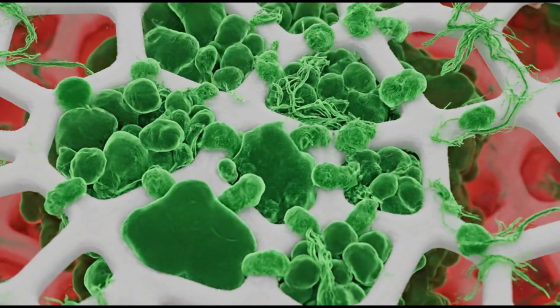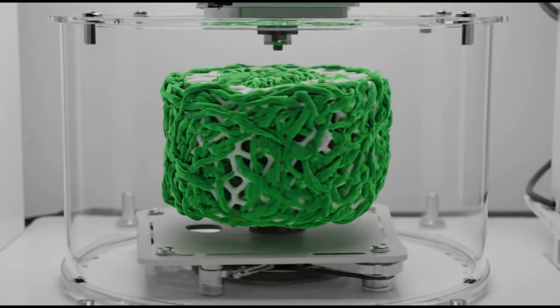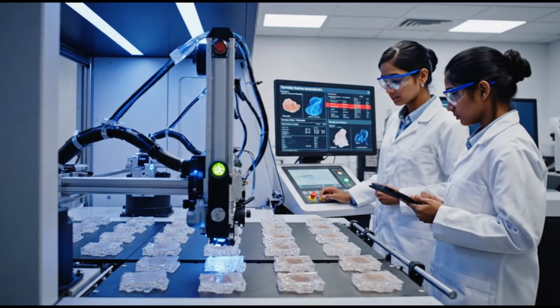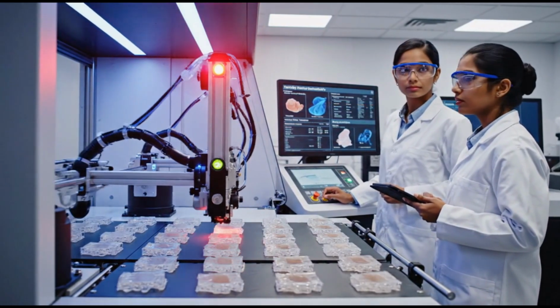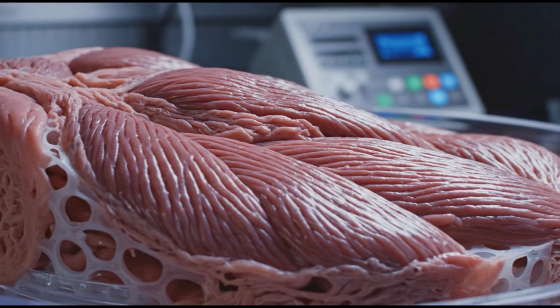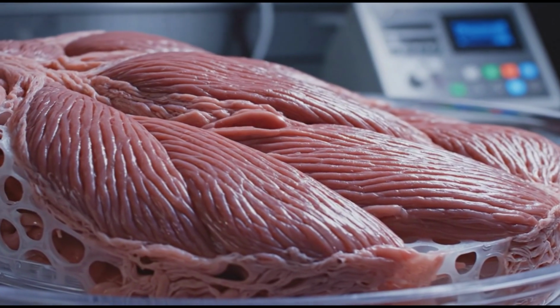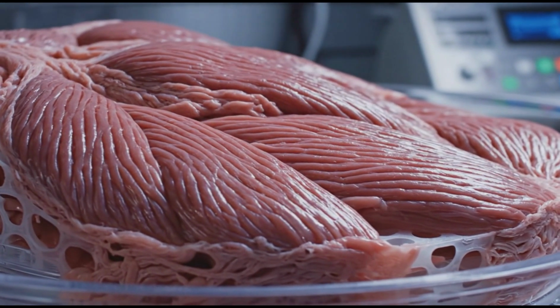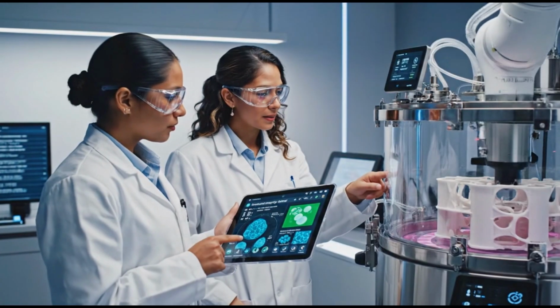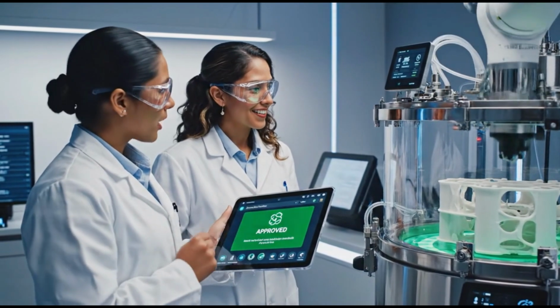Nutrient composition adjusted for structural strength. Cells respond by increasing fiber density. The system flagged scaffold 3B. Rerouting it to the analysis tray now. Automated systems prepare structures for maturation phase, nutrient flow stabilized carefully, cells firmly attached.